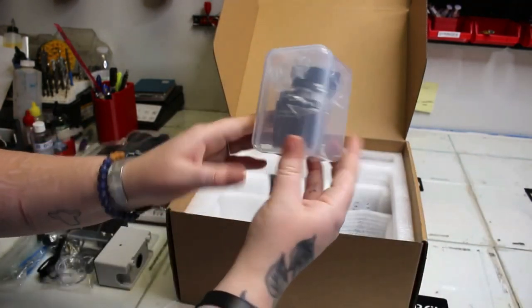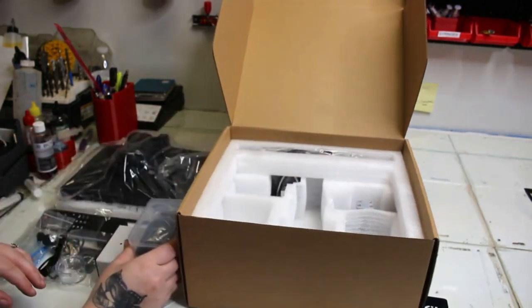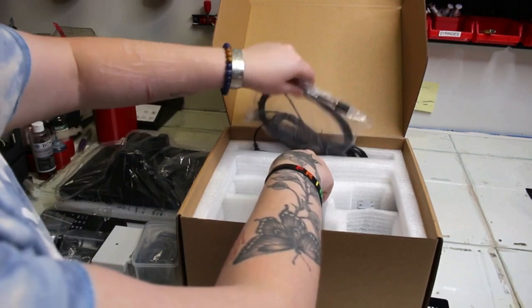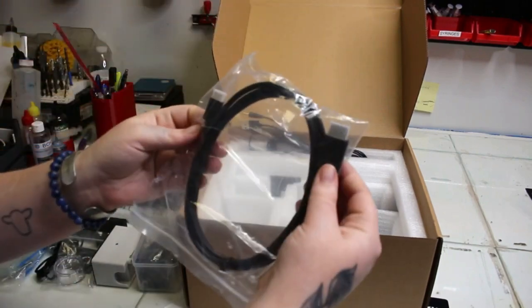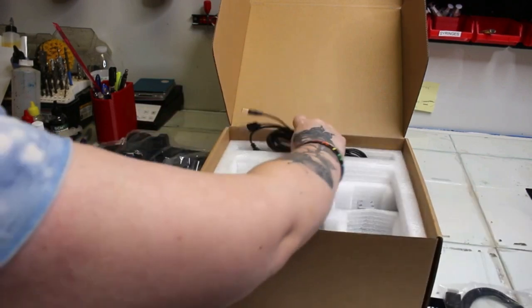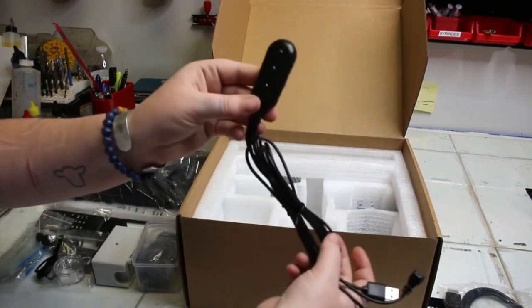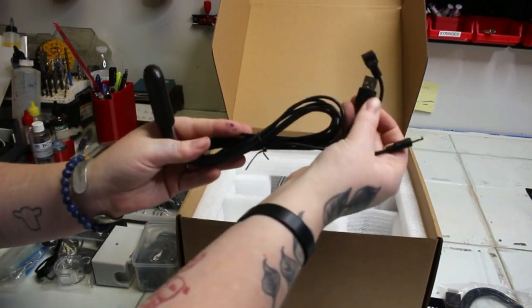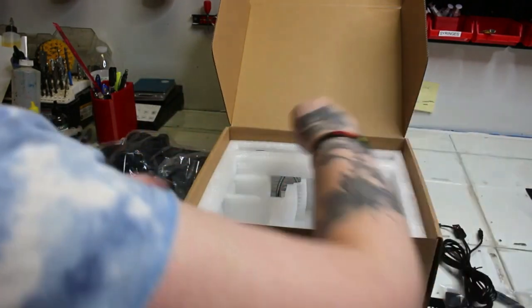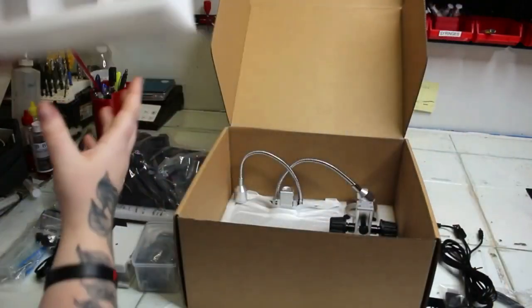Here are our other two lenses, put in plastic bags in a protective white plastic case so they don't get scratched. In the back, we're given an HDMI cable that we can plug into the microscope, and also our dimmer cables so we can brighten up the microscope or dim it down — and that's the power on button. It comes with three cables connected to that dimmer. That's everything on that first level.